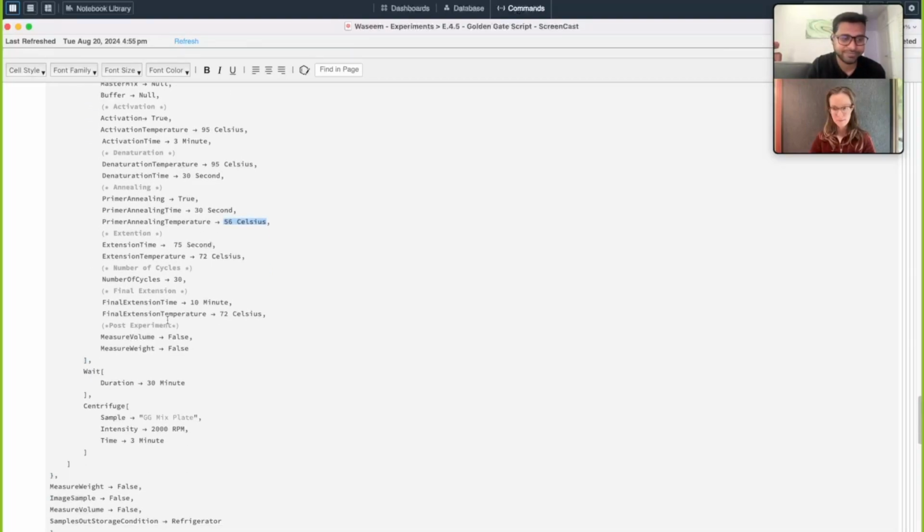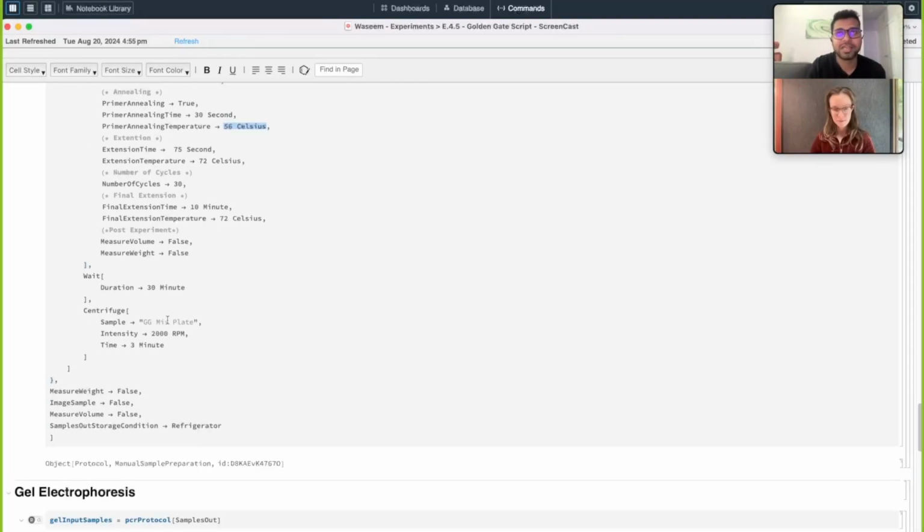That's a really good point. If you have an Eppendorf tube or a Falcon tube, and you want to centrifuge it in the middle of a robotic sample preparation protocol, it will take much longer because they'll have to move it to a centrifuge that is compatible with that bigger container. And I think the Eppendorf tubes also have to be manually loaded into the centrifuge. Spinning things down in a 96 well plate or a 96 well PCR plate is always going to be much easier and faster, especially for high throughput operations.